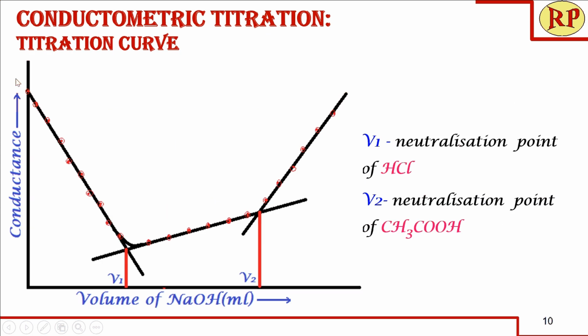Finally, we need to draw the graph, that is, plot all the points and draw these 3 lines. Here you see that the maximum number of points are falling on each line, and due to the initial fall we are having a curve. Don't worry about it. Draw a straight line and see that you get 2 intersection points.